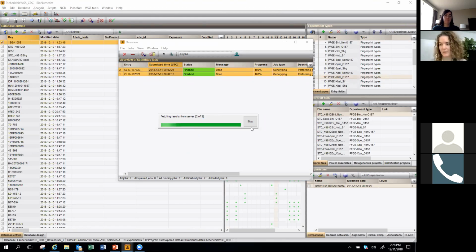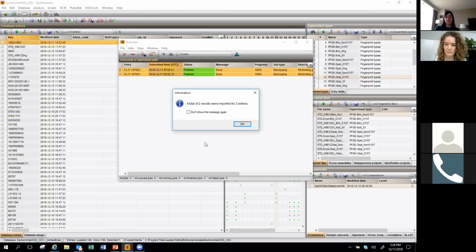Stephen, if that takes a sec, we've got a good question in the chat box. What is the advantage of having a local reference versus using NCBI? Well, the local reference is a way to basically import your sequence data as it comes off of the sequencer, so you can get answers within just a couple of hours. If you upload it to NCBI, then it takes some while for them to post it and you get those results.